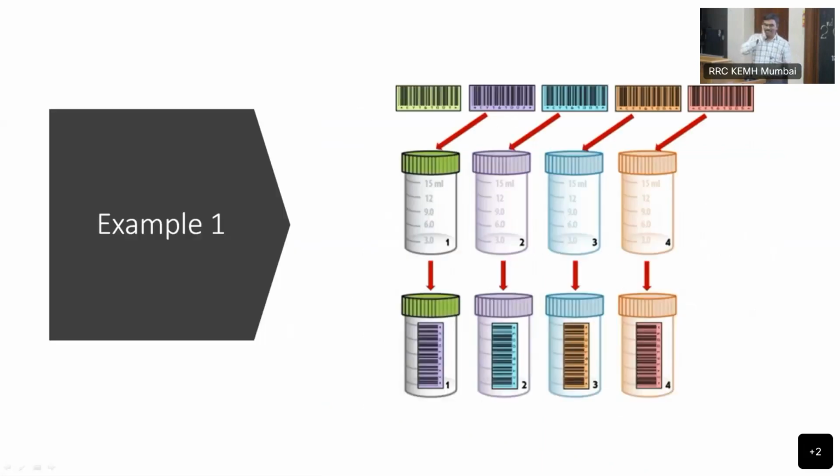Yeah, we come to that. Okay, I'll give you an example of this. Say there were 25 biopsy specimens. One lab was there with a table in the middle of the lab, and a technician who used to label all the 25 samples and send them to the lab, for biopsy, or maybe for frozen section or whatever. They are out for the process. She was having some problem, and next day we got all 25 diagnoses different.